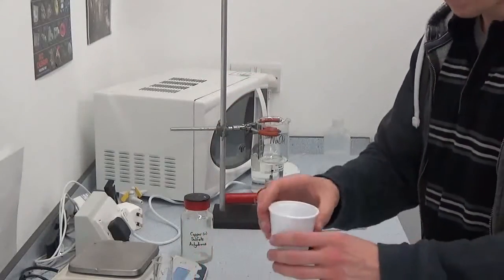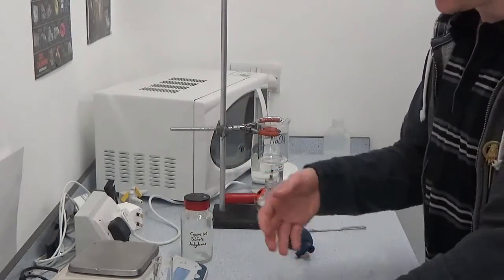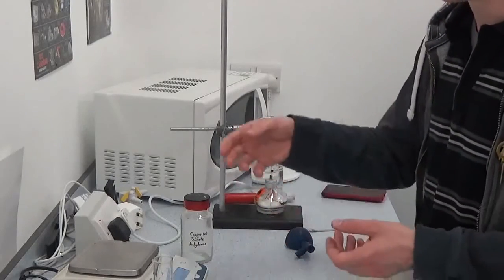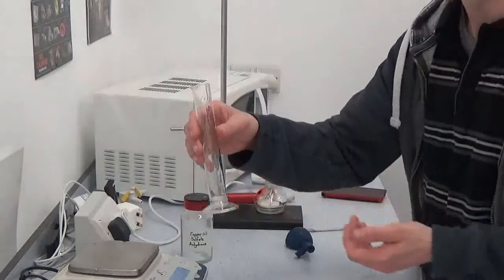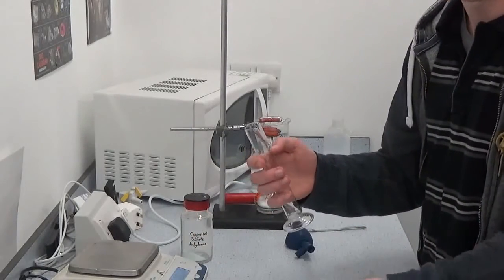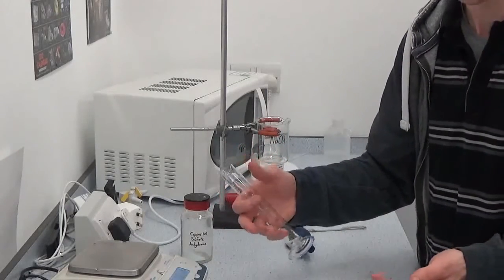So it doesn't always have to be solid put into water in this case. You can do this with an enthalpy of neutralization reaction. So having say 20 cubic centimeters of hydrochloric acid, record the temperature of that for a period of time, and then chuck in 20 cubic centimeters of sodium hydroxide for example.